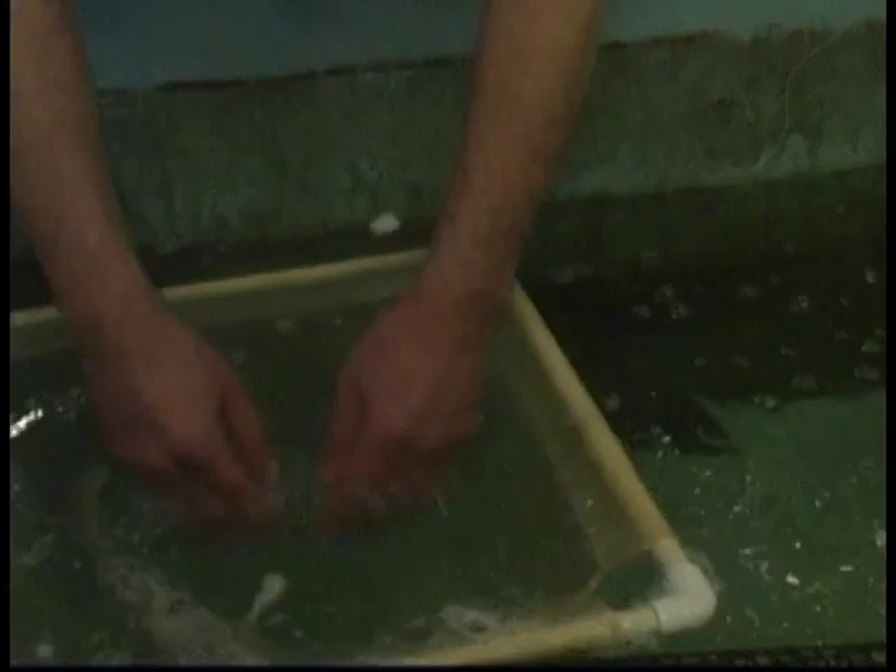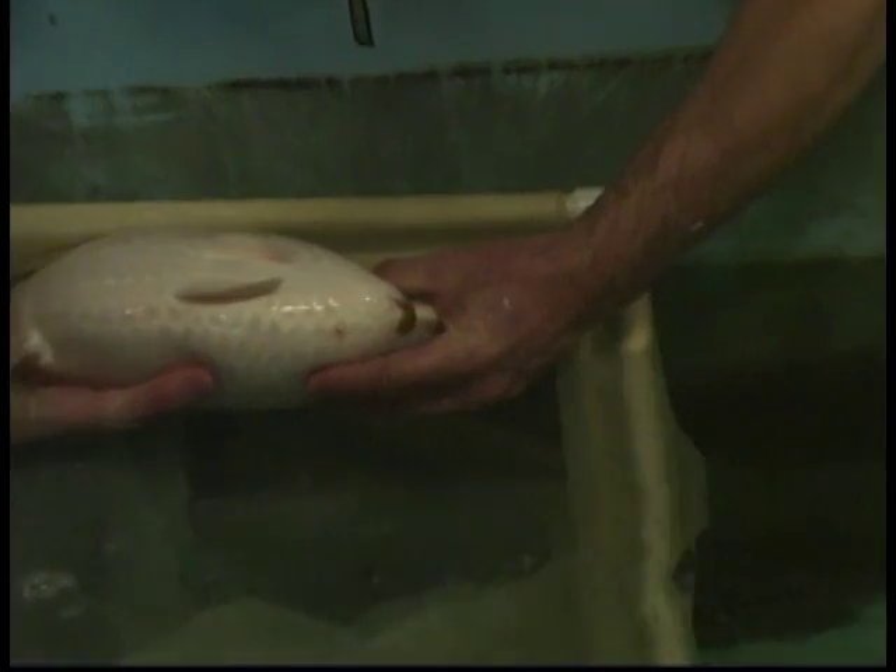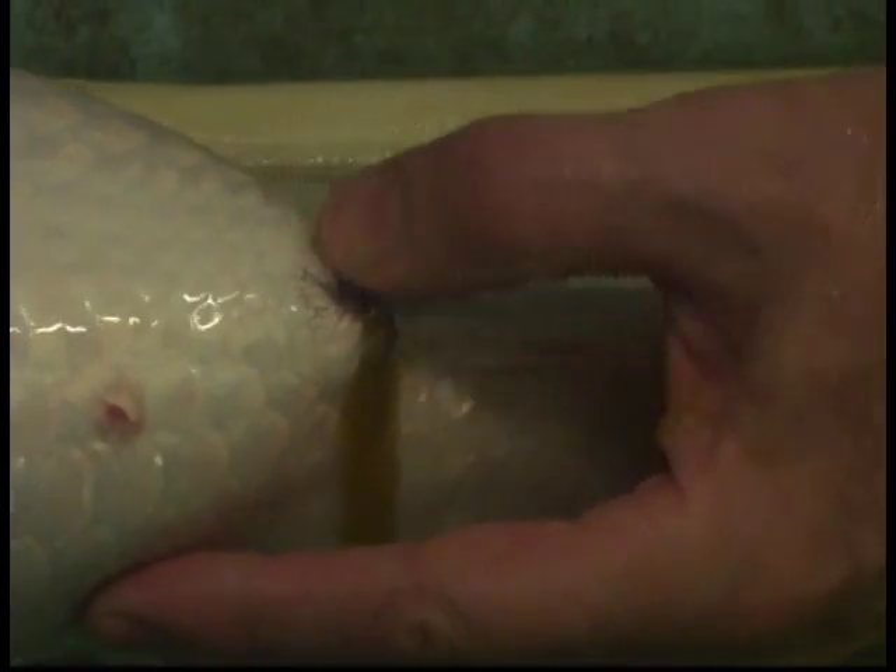Females which are ready to strip eggs, we put in anesthetic. In order to check females, there is no need to remove the fish from the water. It's enough to turn the female and press on the abdomen. If the female is ready, eggs will flow out from the genital pore. This female is ready to be stripped — you see, eggs flowed. Now I put it in anesthetic.